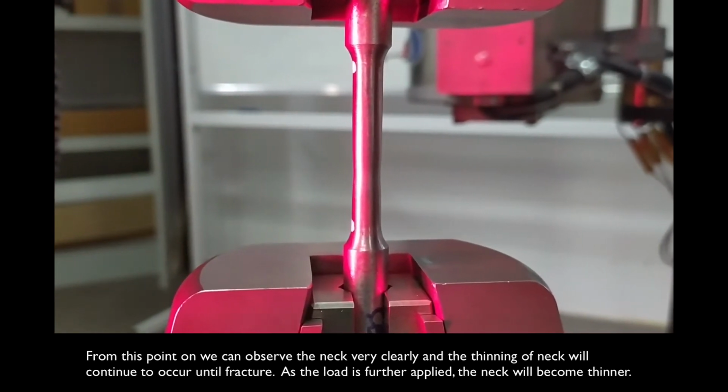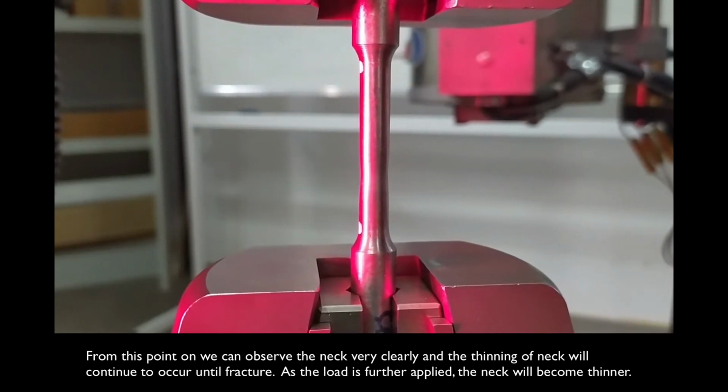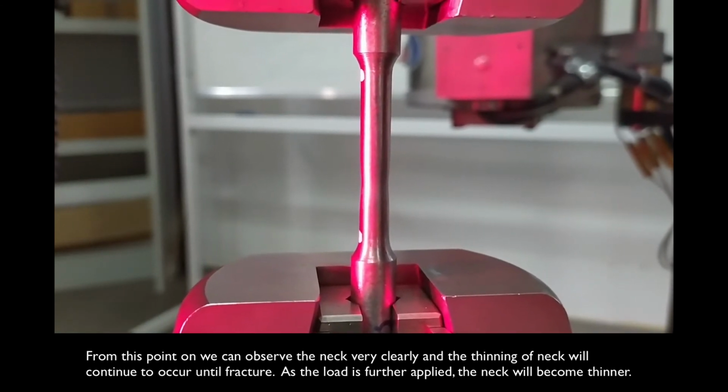From this point on, we can observe the neck very clearly, and the thinning of the neck will continue to occur until fracture. As the load is further applied, the neck will become thinner.